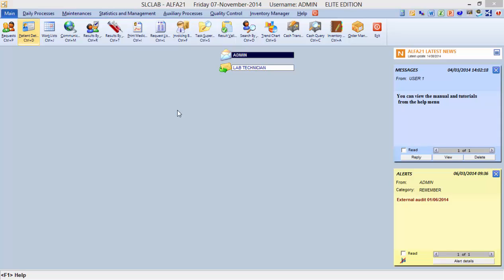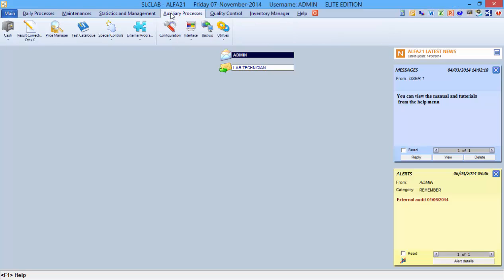In this video, we will learn the different ways to validate results. First, we will view test validation by request.